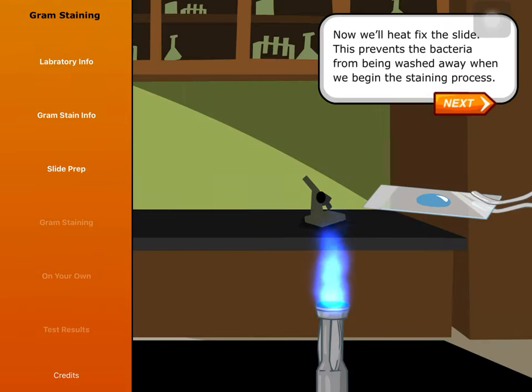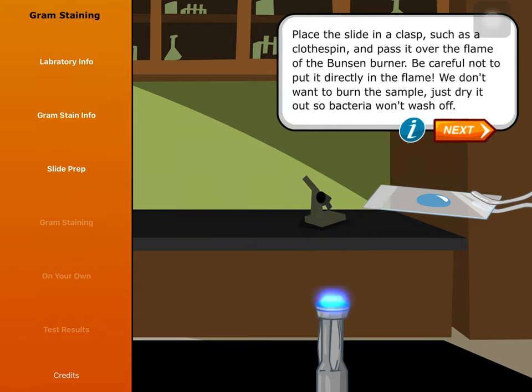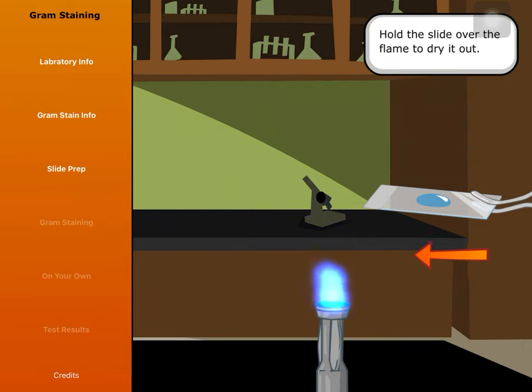Now we'll heat fix the slide. This prevents the bacteria from being washed away when we begin the staining process. Place the slide in a clasp, such as a clothespin, and pass it over the flame of the Bunsen burner. Be careful not to put it directly in the flame — we don't want to burn the sample, just dry it out so bacteria won't wash off. Hold the slide over the flame to dry it out.